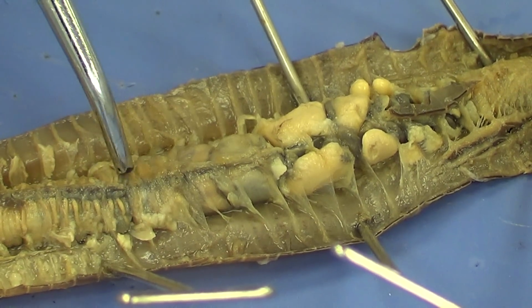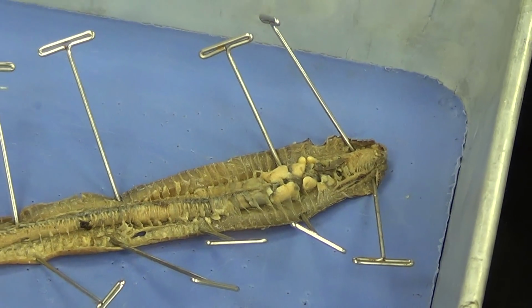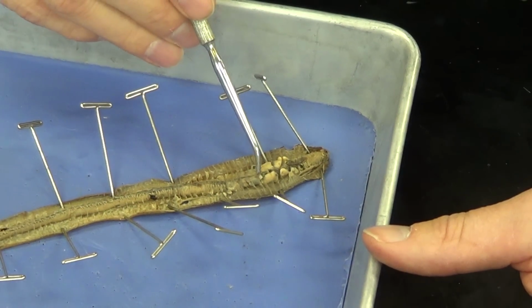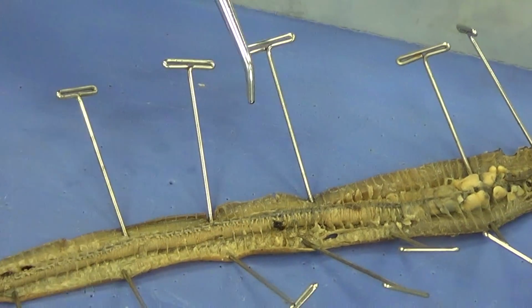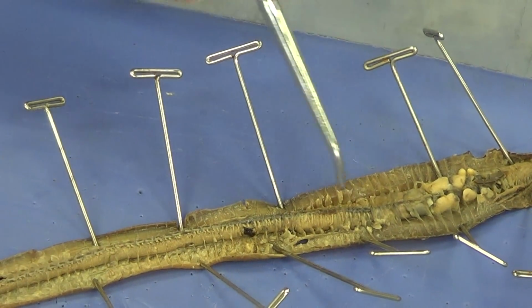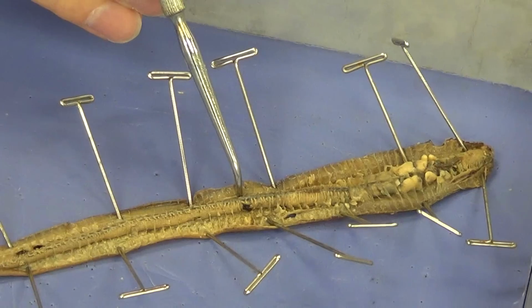From there, we're going to go into the long intestine. And again, we have this long intestine to create lots of surface area. Traveling along the top of the intestine is our dorsal blood vessel. You can see that dark structure right there along the dorsal part of the worm. This is all going to be our coelom, and you can see the various septa along there too.